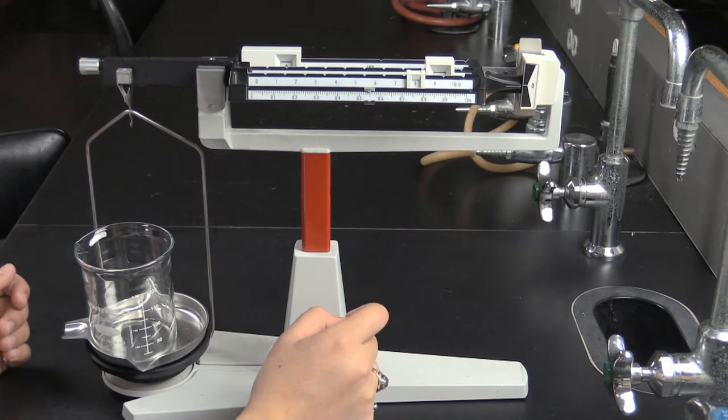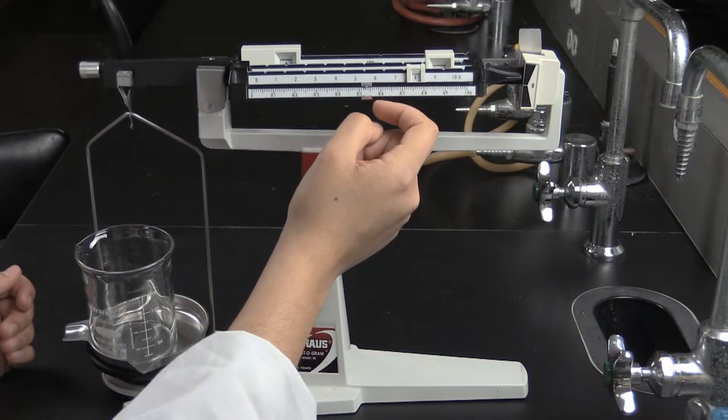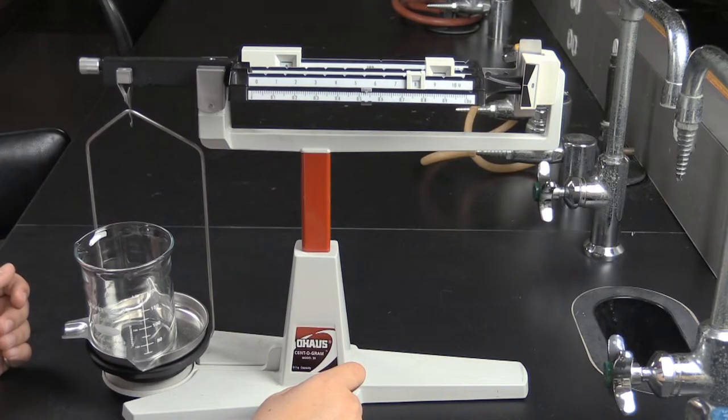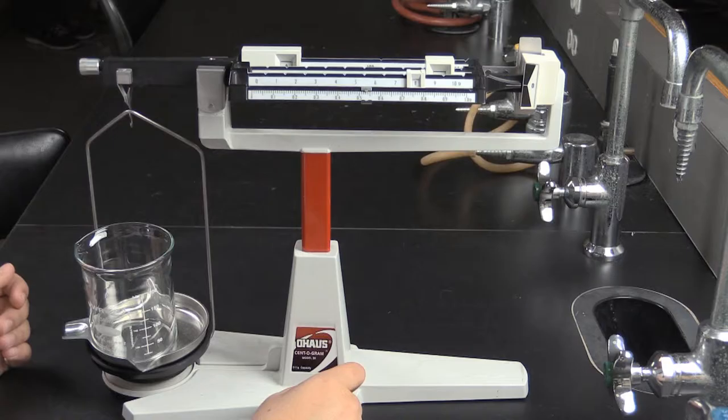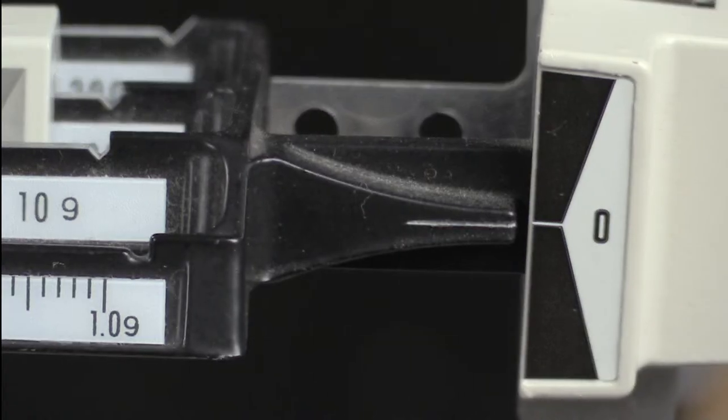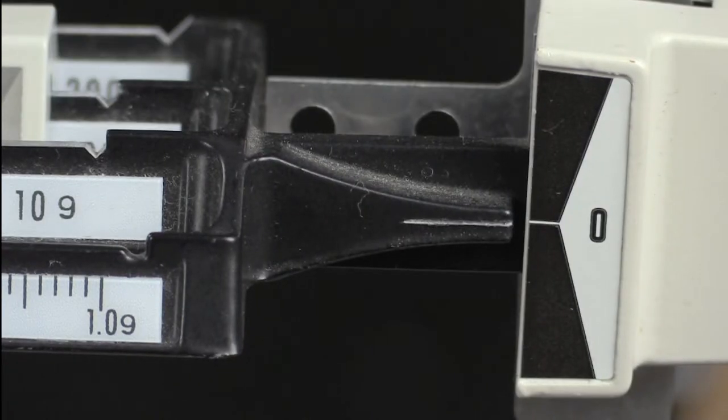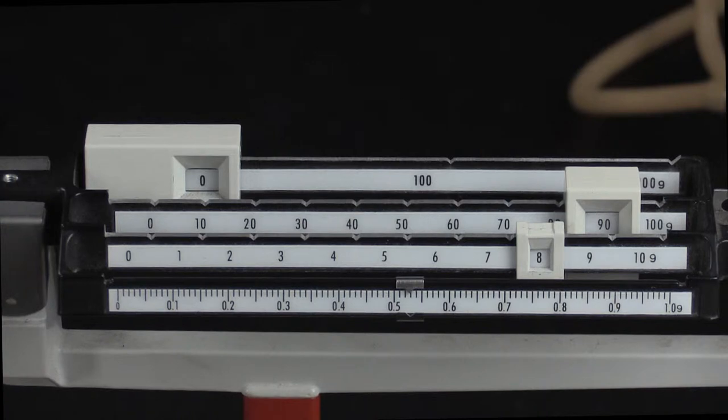The closest slider is the only exception to this, as it has no notches. Slide the smallest slider back and forth until you reestablish balance and the lines line up. Once you have established balance, you are ready to read the balance.